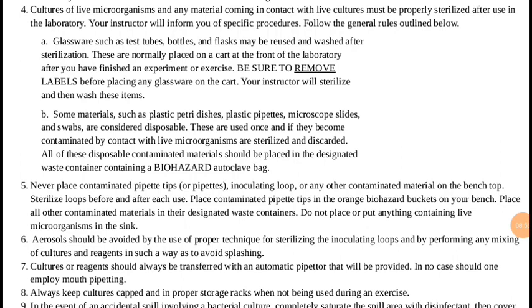Now it is not guaranteed that all laboratories will be having this autoclave bag, but still it is usually advisable that before you dispose any biohazard, it is usually advisable to sterilize them so that we minimize the exposure to other people.